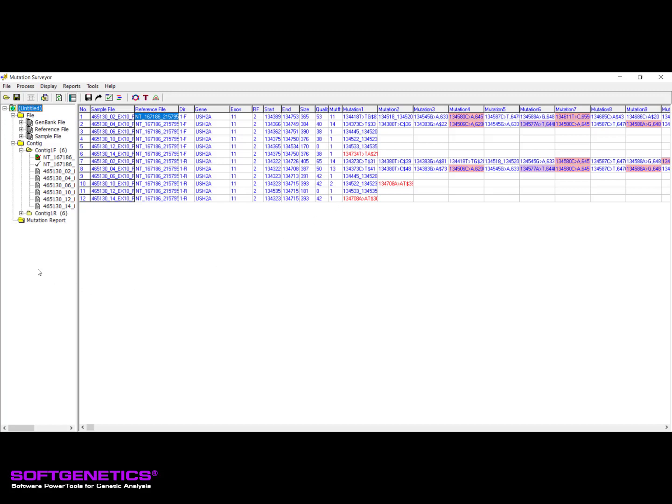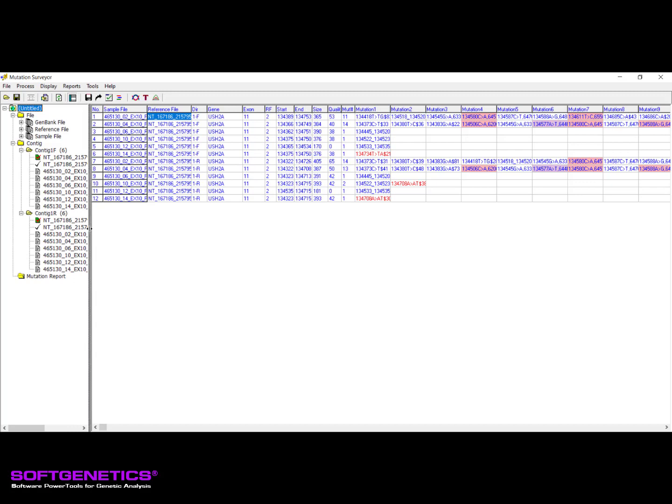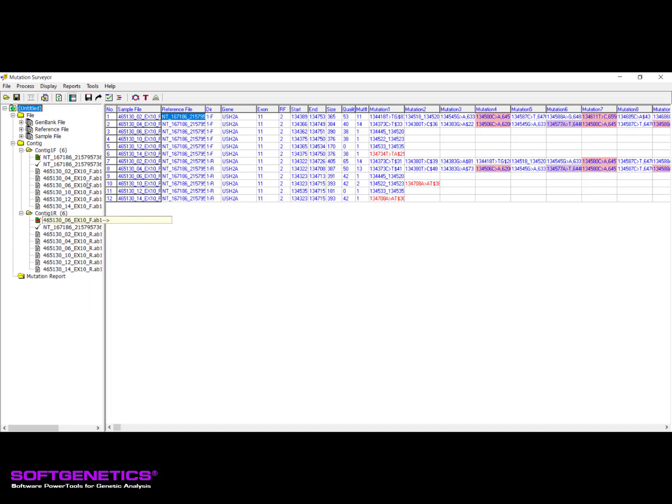You can confirm appropriate grouping of your samples by expanding each contig folder in the left pane or by viewing the direction column of the mutation report. If contig grouping does not appear as expected, please view one of our other available webinars regarding the contig tab options located in the mutation project settings, such as the utilizing Amplicon ID.